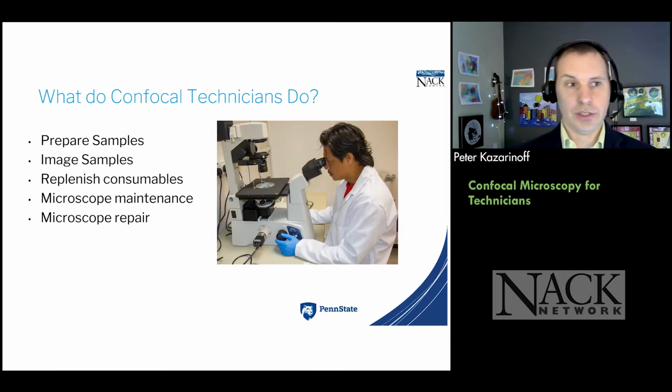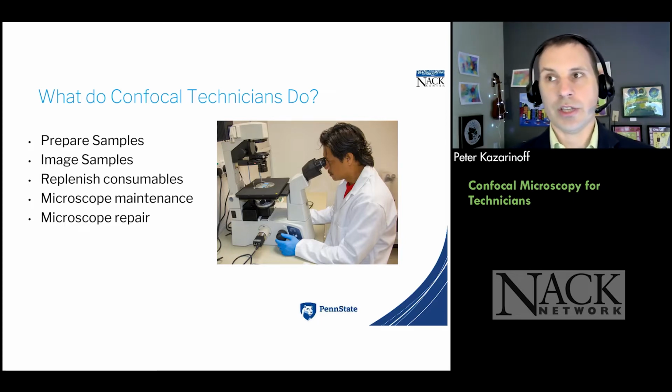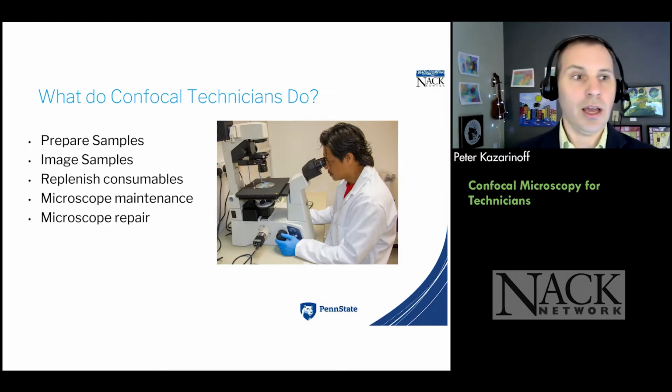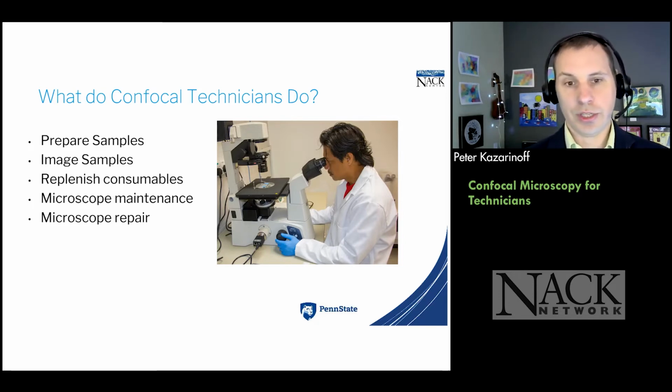We also needed to teach students how to image the samples, how to change the pinhole depth, how to change the level at which they were taking the slice, how to use different lasers to illuminate different samples, as well as how to save those images and keep those images in a shared location that's often used in microscopy facilities.